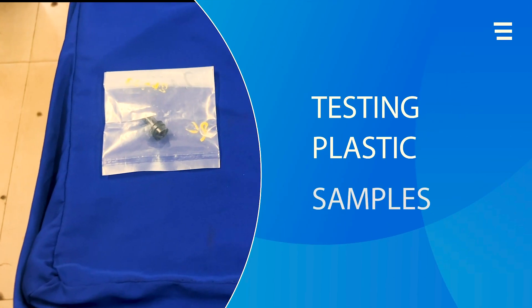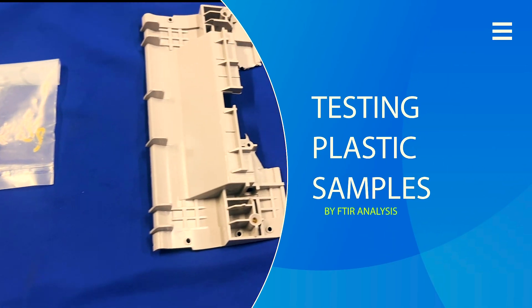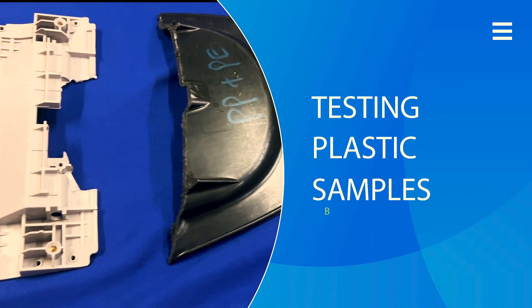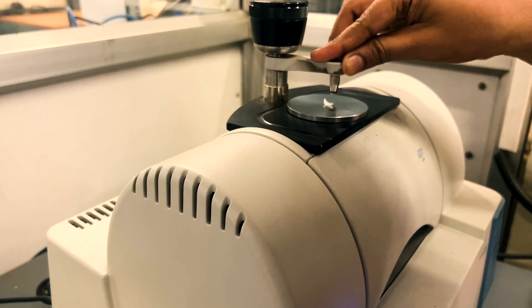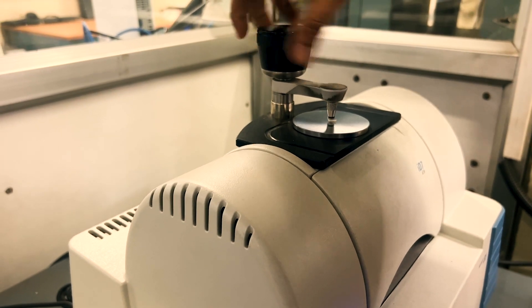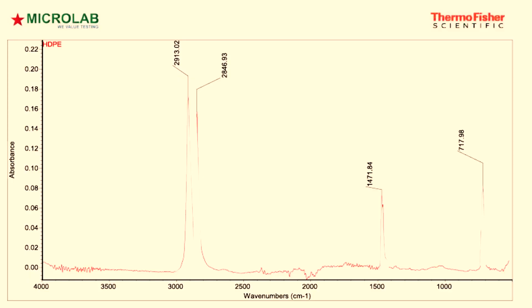I have four plastic samples pulled from different applications. The first sample is a white bar used as part of a board. We are going to cut a thin slice from this material and place it on the instrument opening. After a minute, the final graph is displayed, and we have an option to automatically match the polymer fingerprint with the list of polymers in the database to get the closest equivalent.